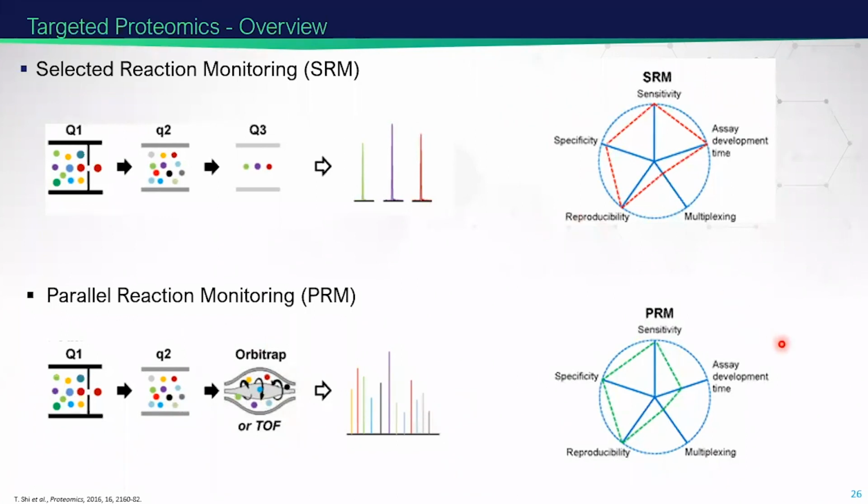To compare, both techniques have good specificity, sensitivity, and reproducibility.